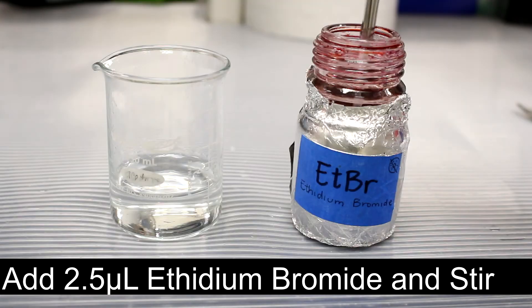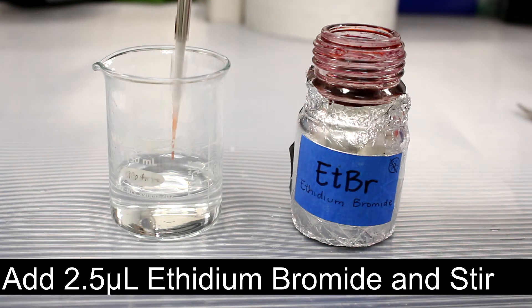2.5 microliters of ethidium bromide is then added to the cool agarose solution and stirred.